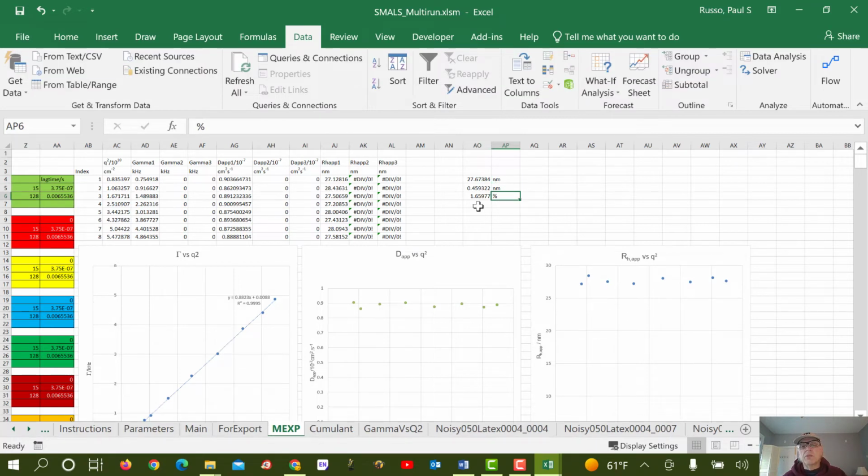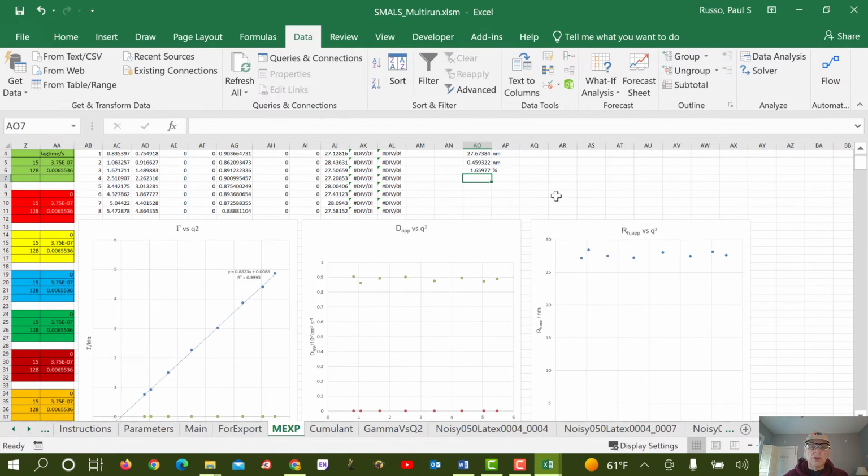Well, the right answer was supposed to be 0.05 microns, so that'd be 50 nanometers, and we're getting more like 54, when we double, closer to 55, huh? 55.4 maybe. So actually, that's probably pretty good. I don't think there's any reason to trust the vendors more than we trust ourselves on these things. If you wanted to corroborate this, you could use other methods. This would be a little bit difficult to do by static light scattering, but you could do it with X-ray scattering or something like that.